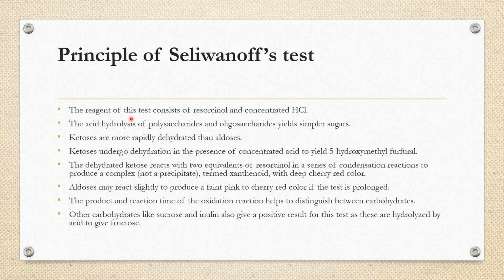The reagent of this test consists of resorcinol and concentrated hydrochloric acid. These two components are the basic components of the Seliwanoff reagent. The acid hydrolysis of polysaccharides and oligosaccharides yields simpler sugars.